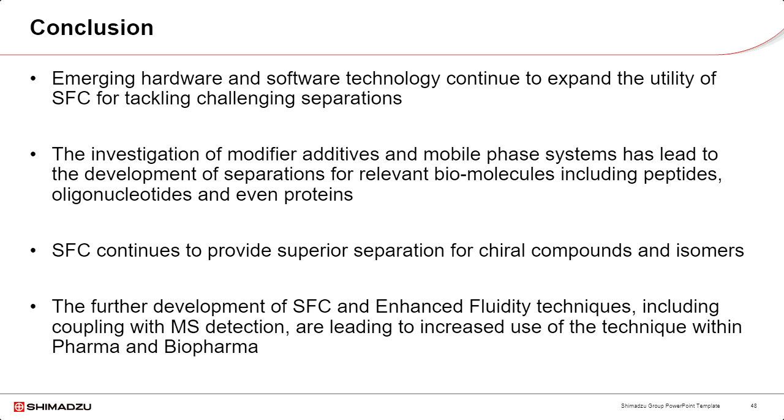We know that SFC is always a great utility for separating chiral compounds, for doing purification with a minimum of dry down, a minimum of used solvent. But we should also be thinking how these techniques can be integrated with things like mass spec detection, and how we can apply that in areas like ADME and DMPK to gain what we can from the enhanced sensitivity as well as chiral selectivity of SFC. So I hope that this has been insightful to you and that you can find uses for SFC techniques within your own quests in pharma and biopharma.